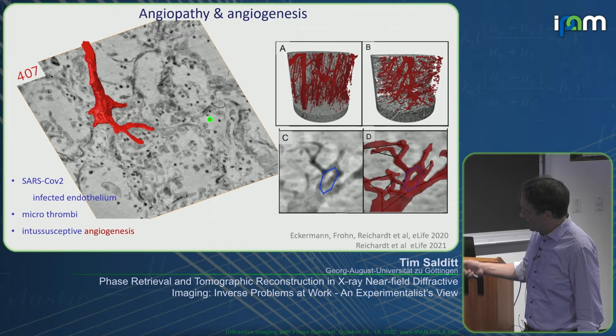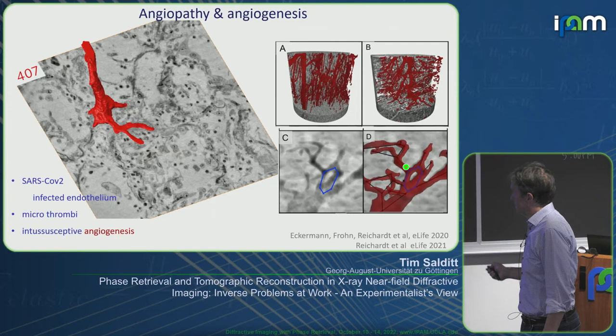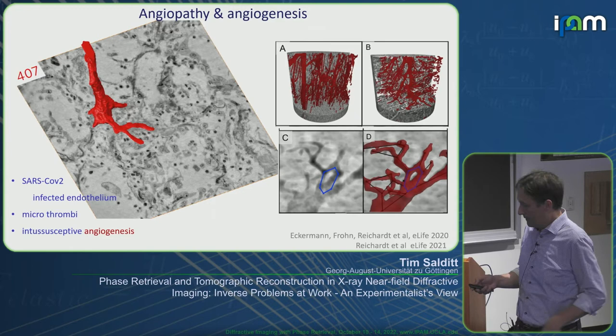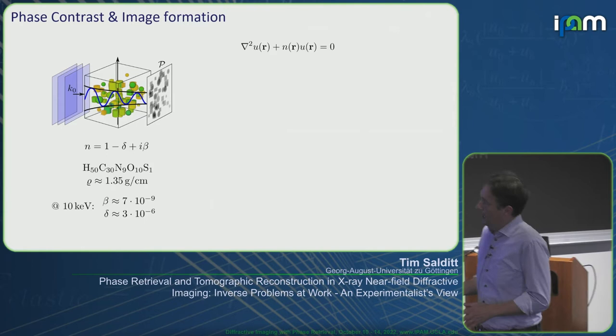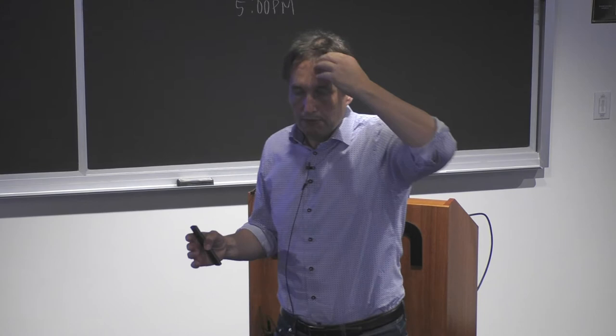We then use segmentation to see how healthy and pathological states differ, where you have something that certainly you don't want in your blood vessel systems, in your vasculature, any loops. Yeah, and you can use also graph theory to quantify this. But these are just examples. And what that tells us is that these full field views and just one angular range go a long way, because you can really tailor your resolution and your field of view, and you can see large 3D volumes.